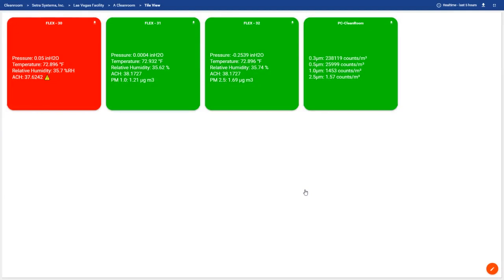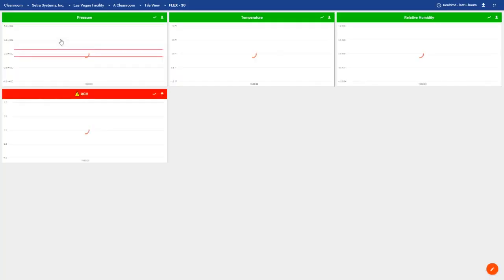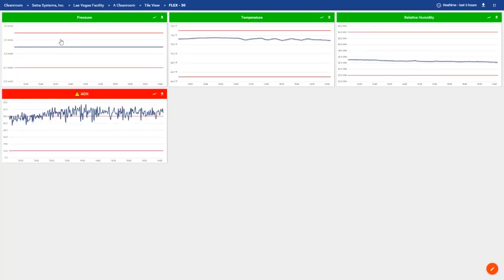By clicking the device tile, the user is navigated to a view displaying individual parameter and channel graphs. The blue line represents the variable data, while the red line represents the user-defined upper and lower threshold limits. Again, a user can export individual parameter data or channel data for a custom-defined time window, and a user can visualize the individual parameter or channel data in full screen by clicking the lightning bolt in the top right of each graph next to data export.